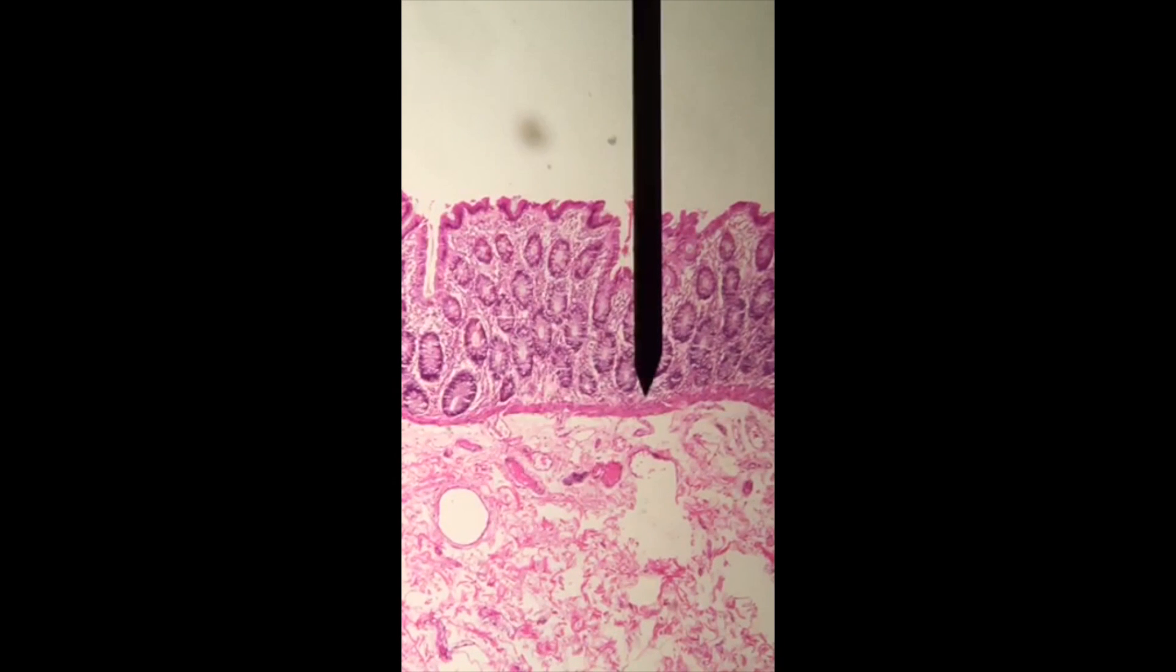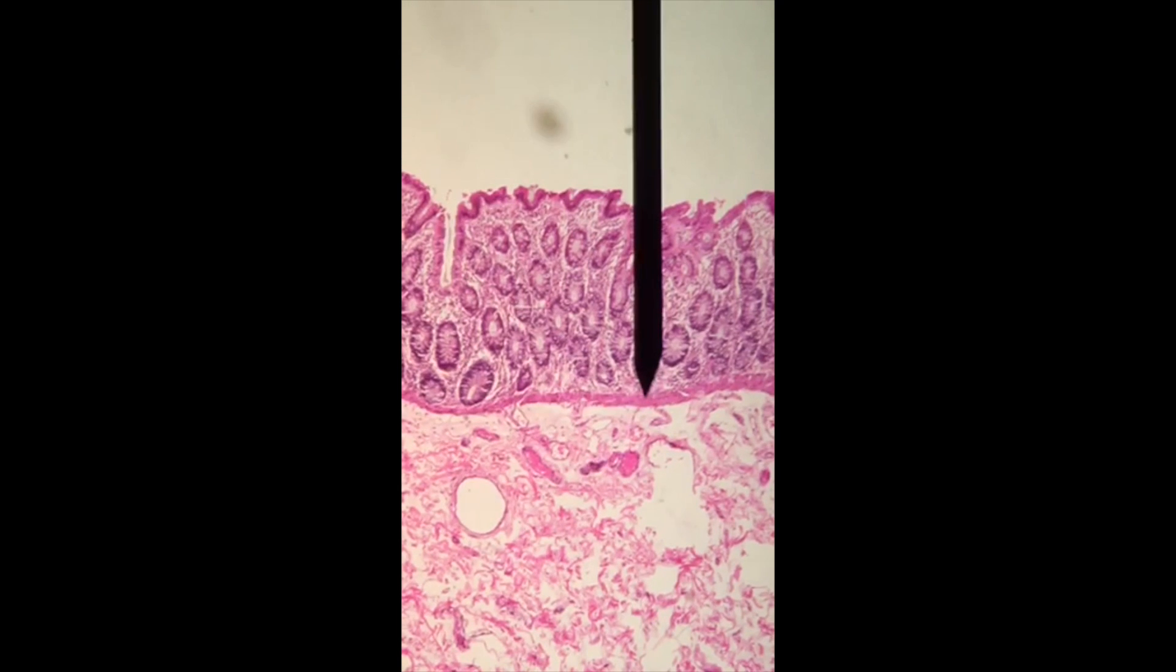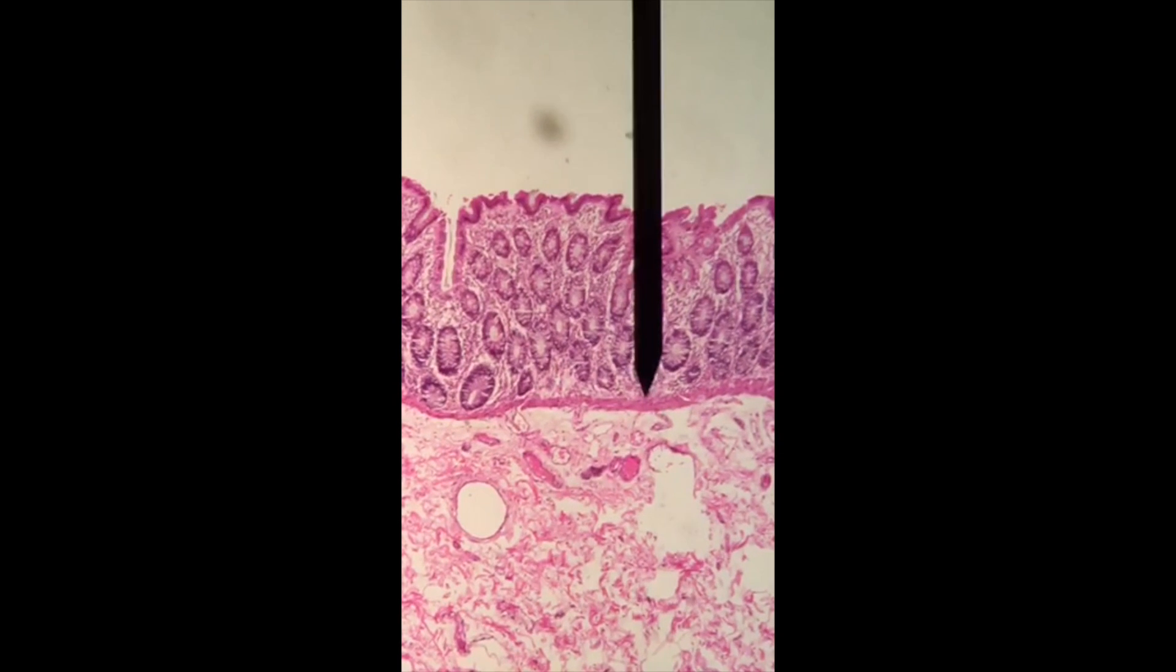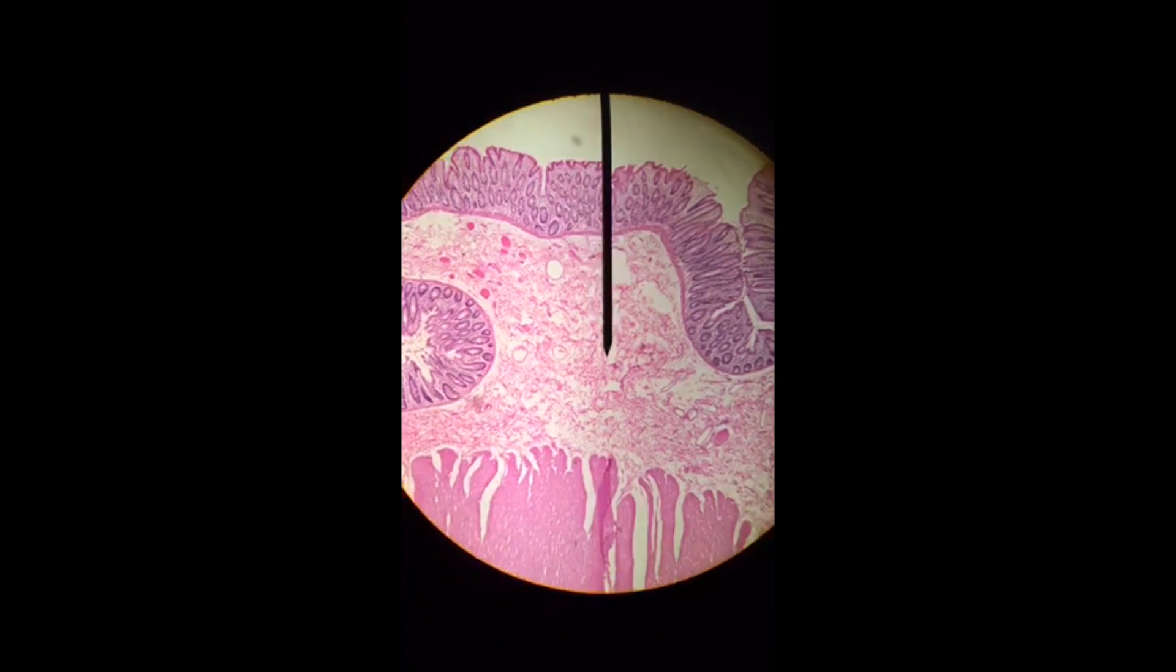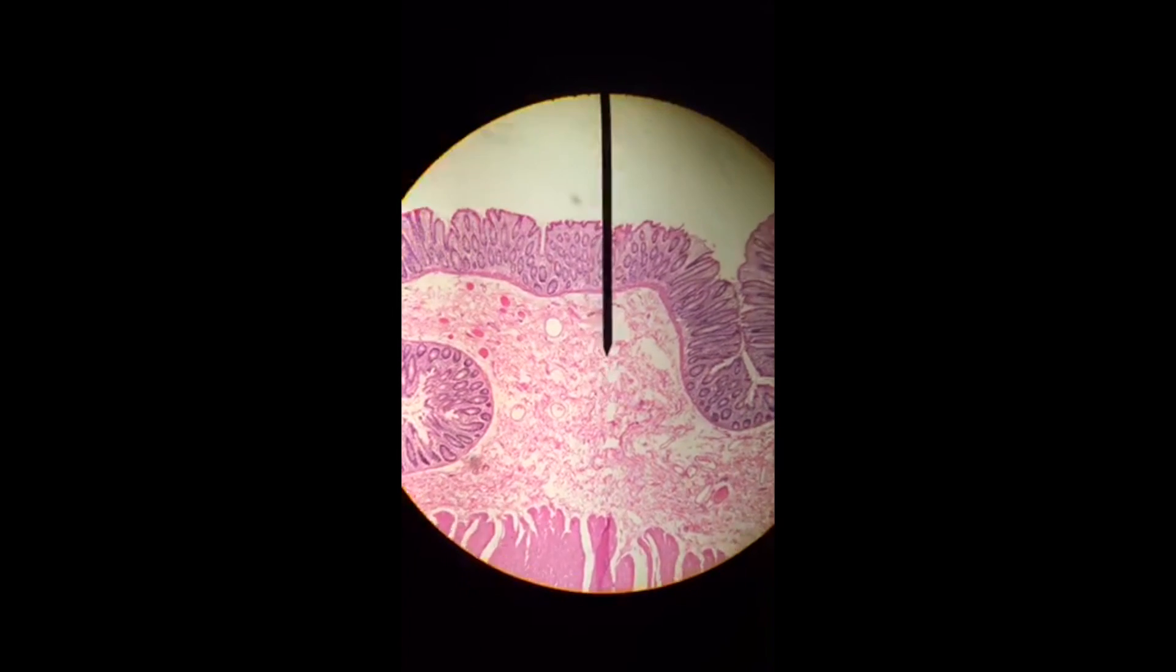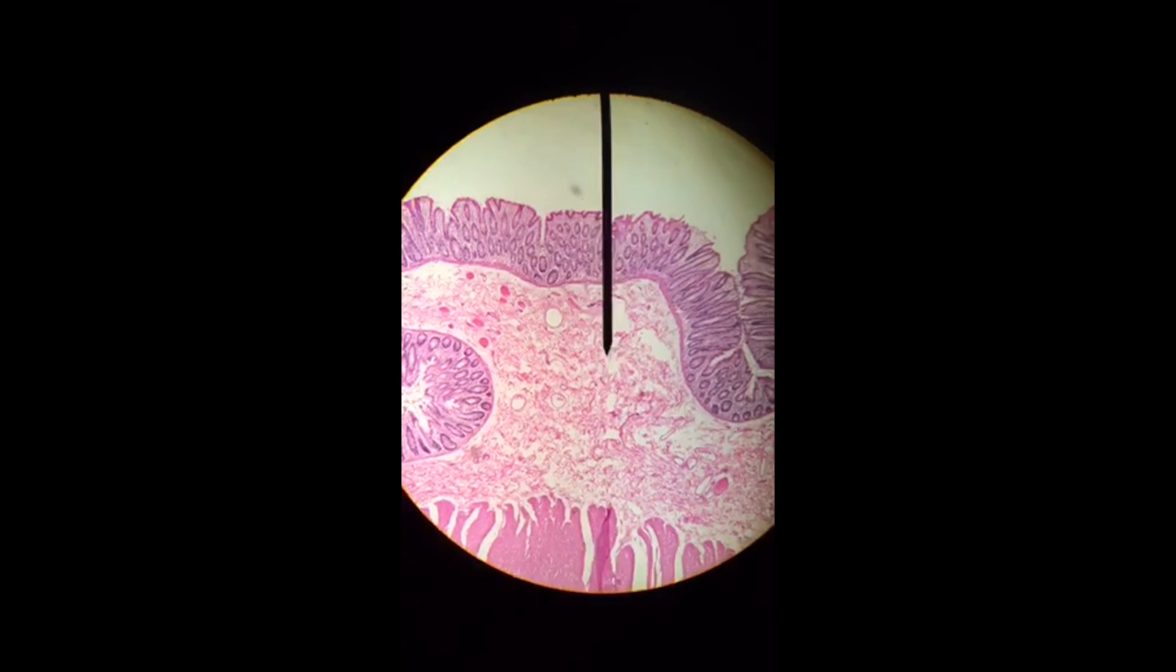We're going to zoom in to take a closer look at that little band of muscle known as the mucosa muscularis. And below it we're going to navigate to our submucosa. Again, connective tissue, blood vessels, lymphatic vessels are going to come through here.